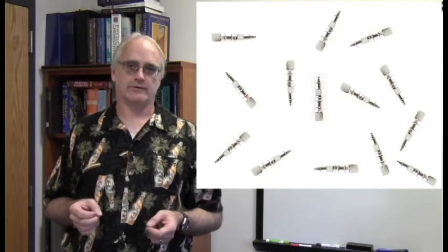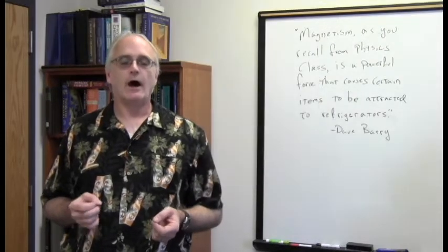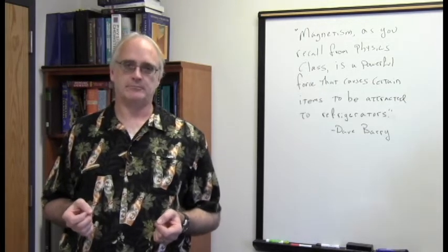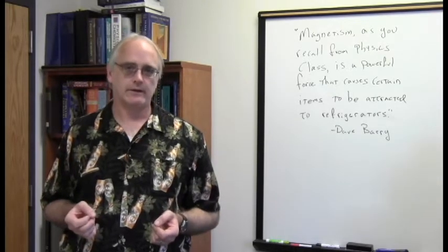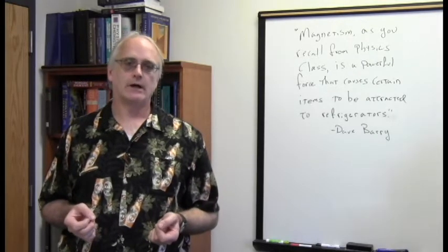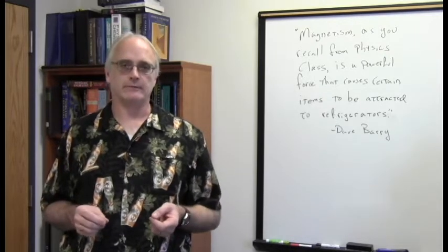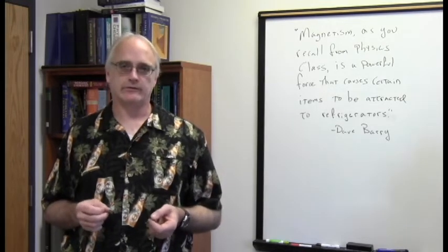But now we do something very interesting. We introduce the external magnetic field. Often in a diagram you will see it represented by a big arrow and often by a capital letter B, sometimes written with a subscripted 0 nearby, B naught. Exactly why they chose B and why that's used, I'm not sure. I kind of like to think it stands for big ass magnetic field, but I'm not sure if it really does or not. But I'm going to think about it in those terms.